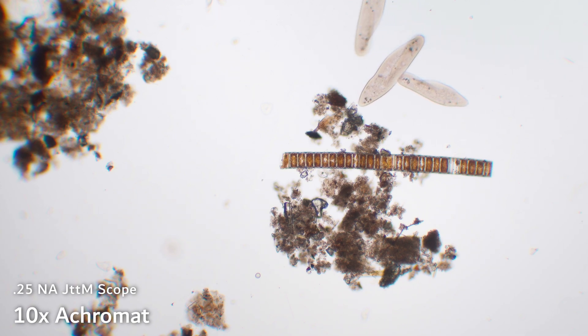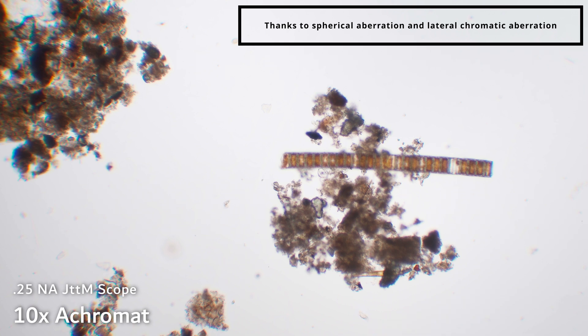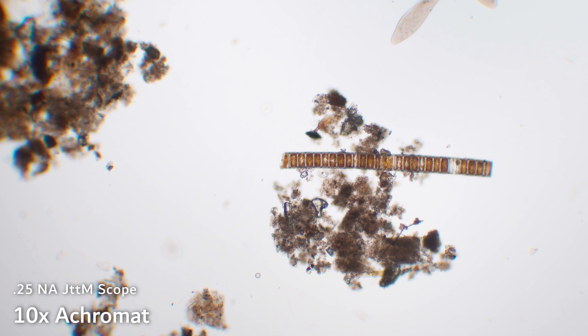If our image sensor was curved as well and matched to that, it would look a little better. But since our image sensor is flat, then only one part of this image can be in focus at a time. So for stuff in the periphery, I can get that in better focus — it doesn't look quite as good, but it looks fine. But when I do that, the center is definitely way out of focus. This is fine for normal viewing, especially because if you're looking through the eyepieces, you're going to be mainly perceiving the center of the image circle. Things that are slightly blurred on the outside of the image circle aren't going to bother you so much.